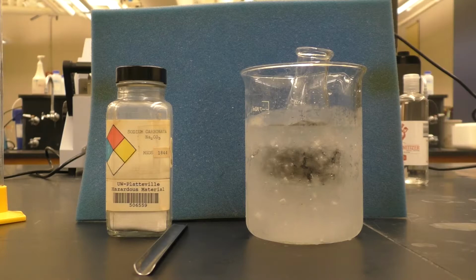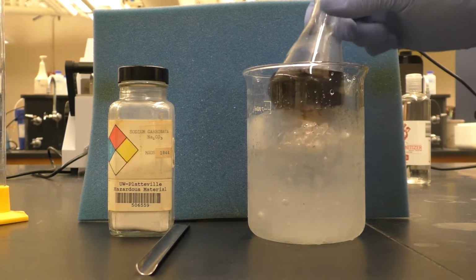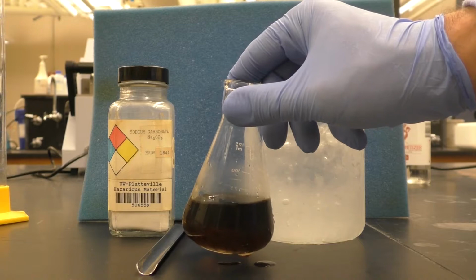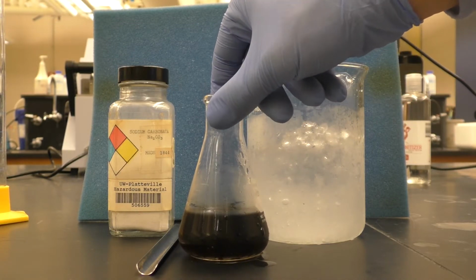So we've let the sample sit in an ice bath for quite a while now, but we're not really getting any crystals or any precipitate to form. We can see here everything's still clear in solution. So what we need to do now is neutralize the solution.